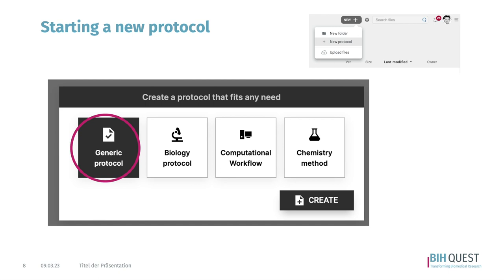Now, at the point where you actually want to start a new protocol, you click on 'New Protocol'. It gives you a window where you have to make your first choice — there are several palette templates. If you do pure chemistry with lots of reactions, the chemistry method is advisable. If your protocol contains code, a computational workflow is suitable. Or if it's pure biology, there's the biology protocol template.